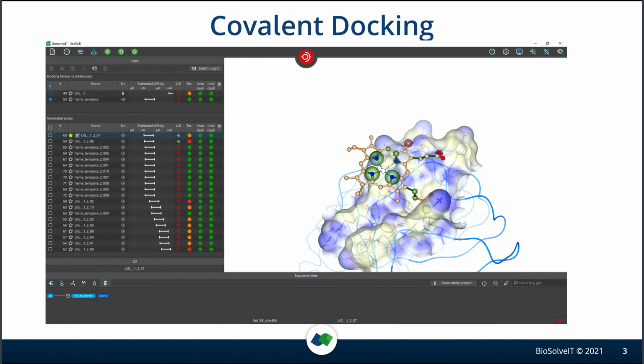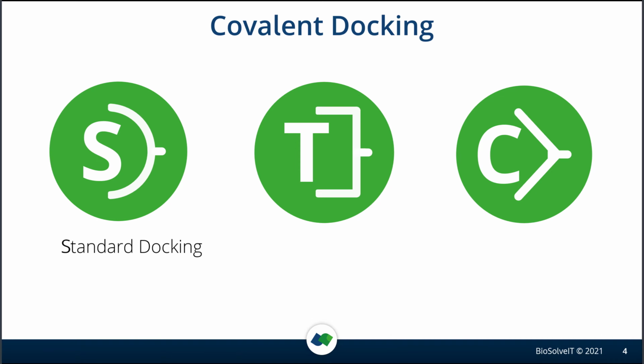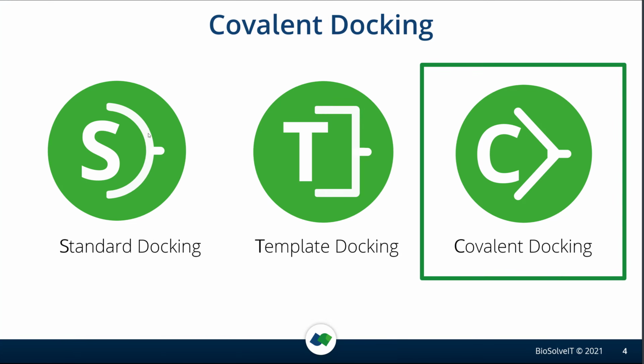The docking mode that you're all familiar with has now undergone a facelift. Fundamentally, the buttons for standard and template docking have been redesigned, and a new button that enables the generation of covalently bound poses has been introduced. As long as you have prepared your protein and ligands for covalent docking, the docking run itself requires just a single click on this new button.